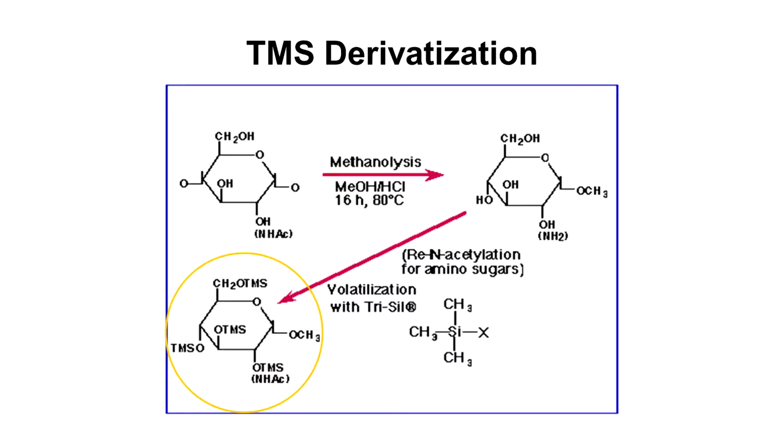Sometimes it may have 1, 2, or 3, or combinations of those. So this is what allows you to measure many metabolites via gas chromatography, but also makes gas chromatography complicated because you have to do chemistry, and chemistry is never at 100%, and it also means that any given compound can have 1, 2, 3, or 4, or 5 different varieties, depending on the level of derivatization.